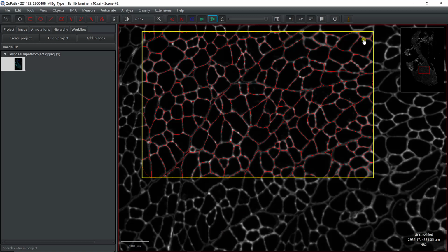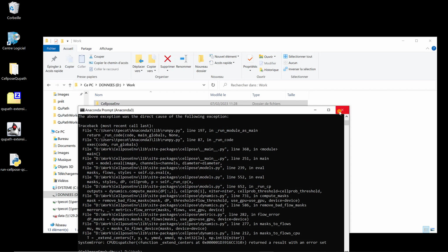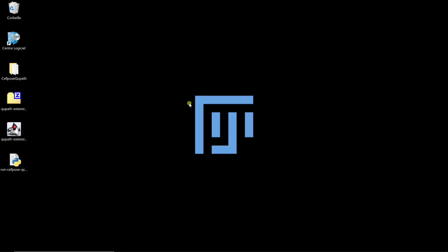I'm going to show you how to do it with Fiji now. So I'm going to reduce everything. I can close this now. And I'm going to start my Fiji.